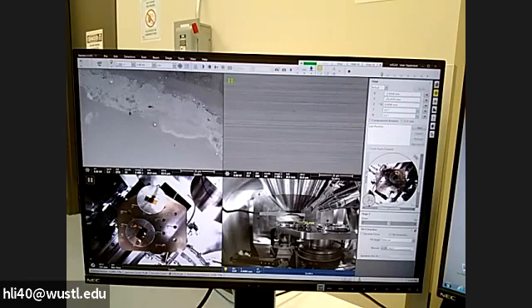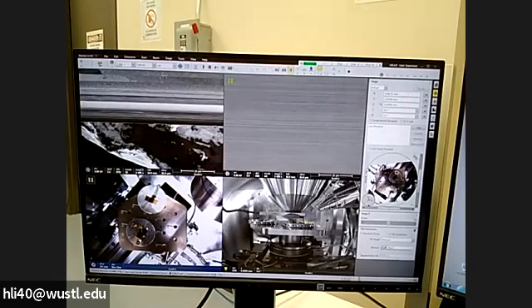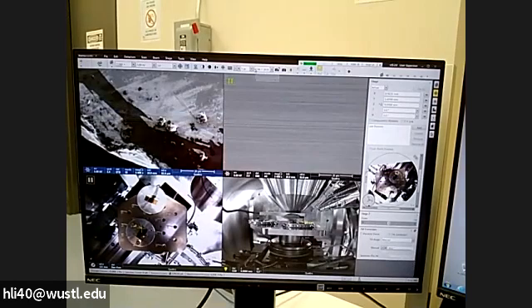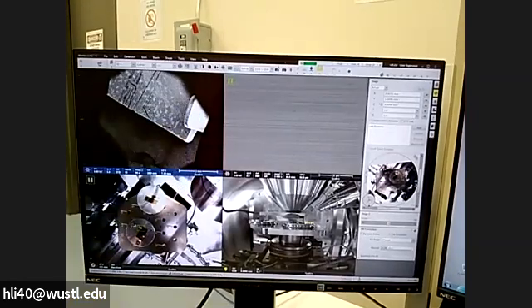So we just simply click or drag this cross mark to the next sample. I'm going to double click, so you will move to the clip, where the copper clip is. Let's zoom out. This is just too fast, so just highlight the screen; you will change it. Just too slow. Now we want the fast scanning. We change the magnification to low. You see the clip here.